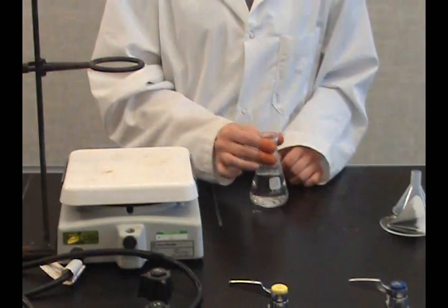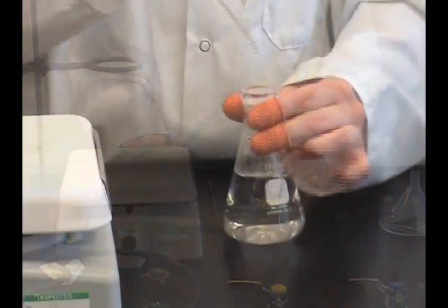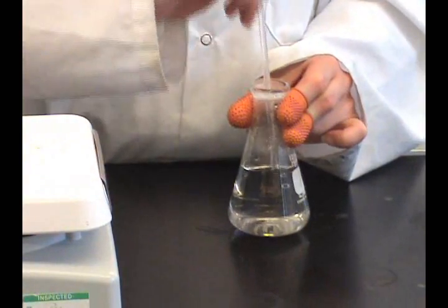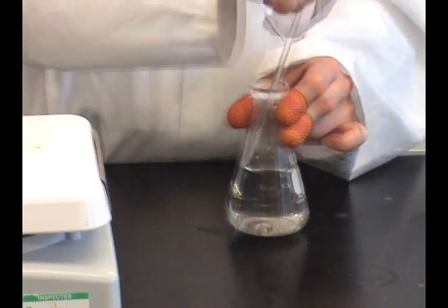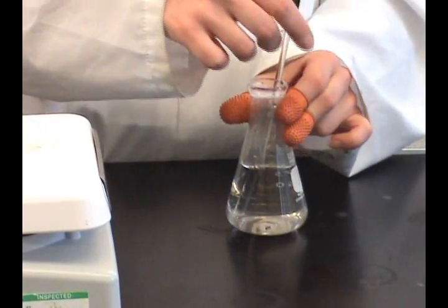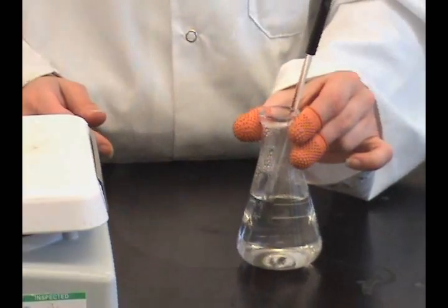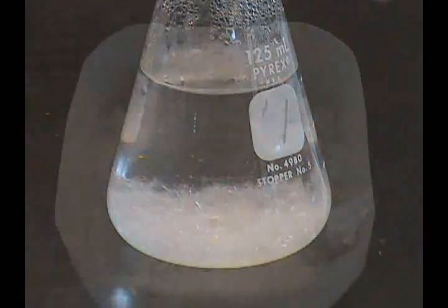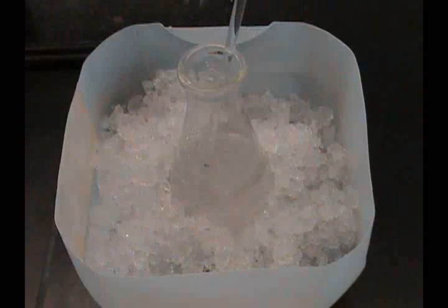Remove the flask with the filtrate from the hot plate. Scratch the sides of the flask with a glass rod and allow it to cool to room temperature. Fast cooling produces small crystals that may trap impurities. When the solution reaches room temperature, place it in an ice bath for about five minutes.